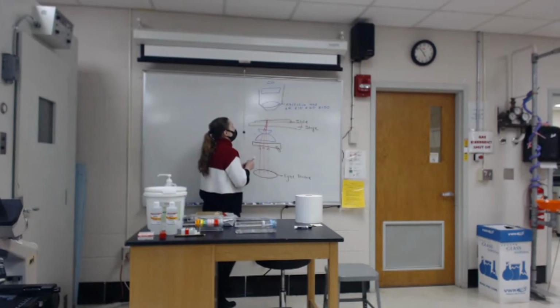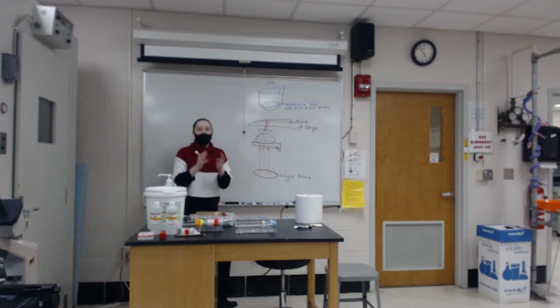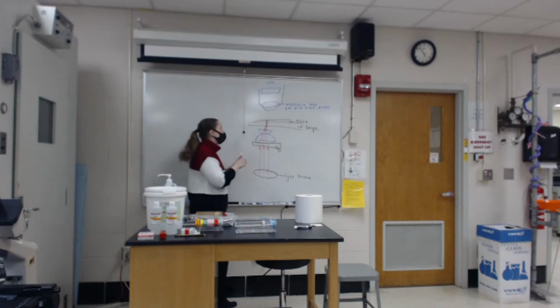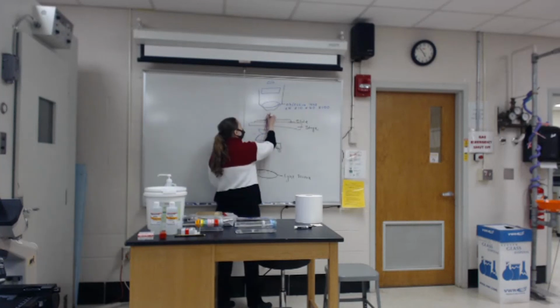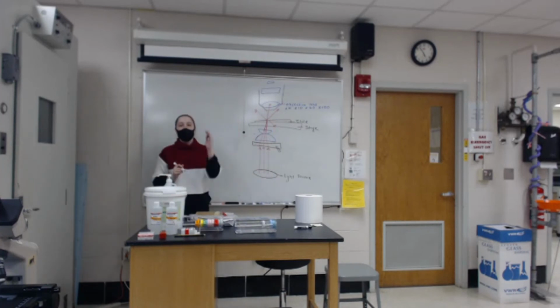One of the things that happens is, because we're changing the type of medium from glass to air, the light will actually refract and scatter. So some of the light will go into the lens, or the objective lens, but others will be moving away from it, or will even bounce backwards through the slide. So it'll hit the edge of the glass and come back.